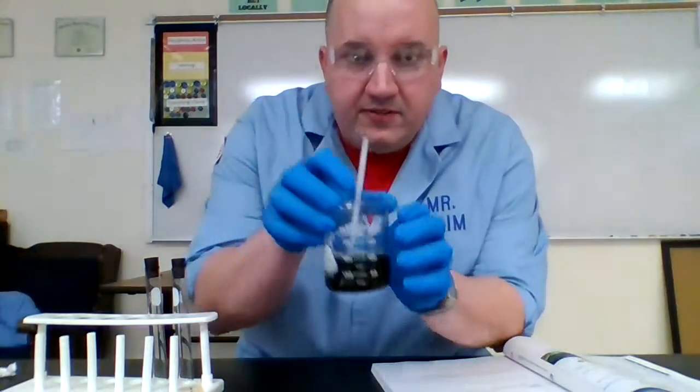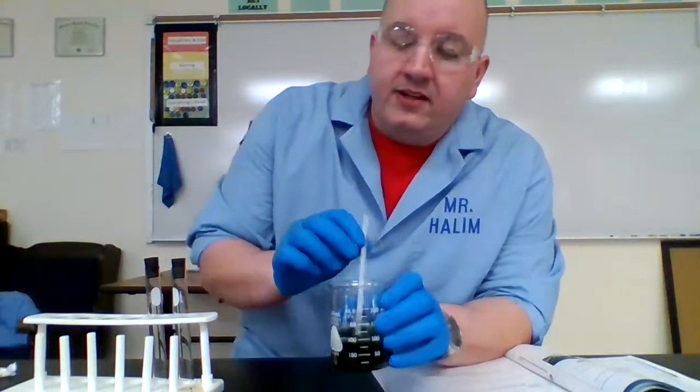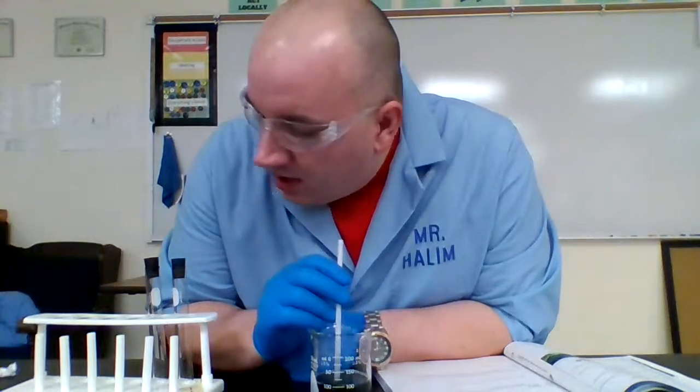Now you can notice on mine, difficult to see on the camera, but now it's turned from blue to green. So now you need to keep blowing into it until it turns to yellow. It might take another minute or 2.